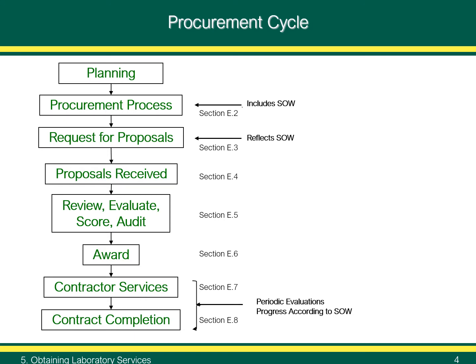Slide 4, the procurement cycle. Note that MARLAP's procurement recommendations generally conform to the Federal Acquisition Regulations, or FARs. Although the FARs do not apply to states, universities, or private sector purchasers of analytical services, most organizations have, or at least they should have, comparable requirements or regulations.